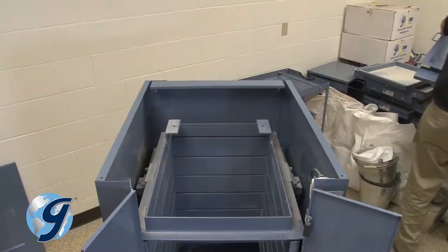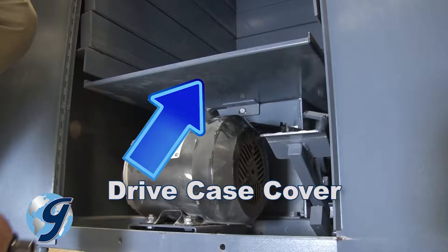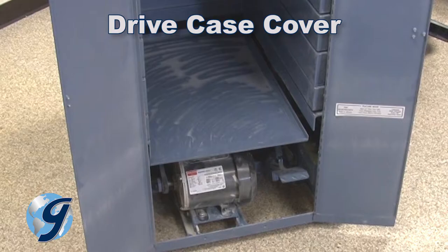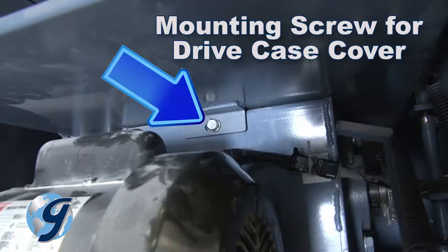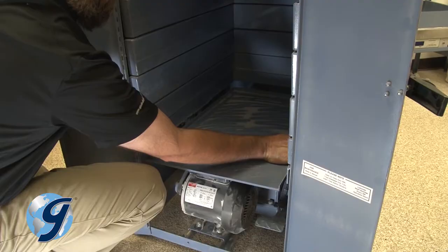To remove the right side panel, you first need to disconnect the timer. The timer connection is fastened to the front of the drive case, which is located under the protective drive case cover. The drive case cover protects many of the mechanisms of the unit from excessive exposure to materials being tested. To remove the drive case cover, from the front of the unit reach under the drive case cover and at its rear center locate the mounting screw. Remove the screw, slide the protective drive case cover towards you, lift off and set aside.